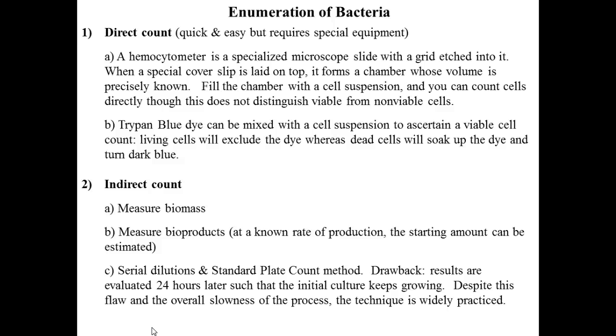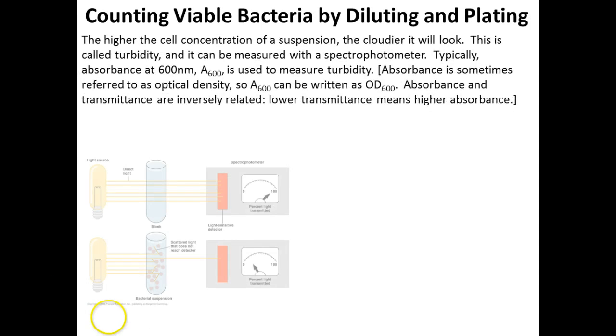Did you guys notice that our plates were different colored today, right? It was two different types of media we're using. Are they going to respond differently? Yeah, right, because it's different types of food, it's a different type of environment. And there's a reason why we use those different kinds of plates.